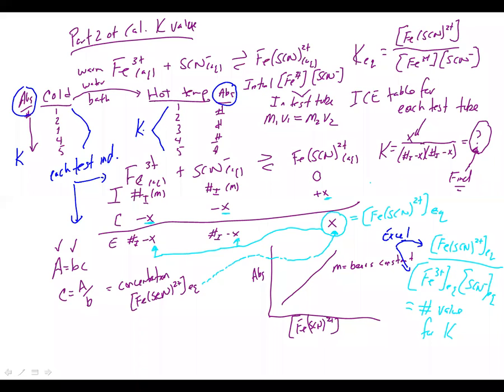You will also need a column with the absorbance values. Then you can have Excel calculate your concentrations, because you need just the absorbance values and Beer's constant for each test tube. So you could put in a formula like equals whatever cell divided by whatever cell.